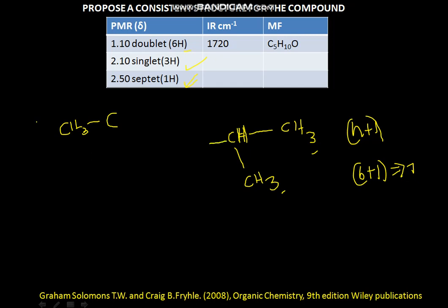Now there is the presence of a double bond, so why not it could be a carbonyl? I'll assume it to be a carbonyl. Now this carbonyl in turn is connected to the carbon which has a methyl, and because this methyl proton finds no proton nearby, it shows a singlet, and because of the electronegative group, it's somewhat downfield.